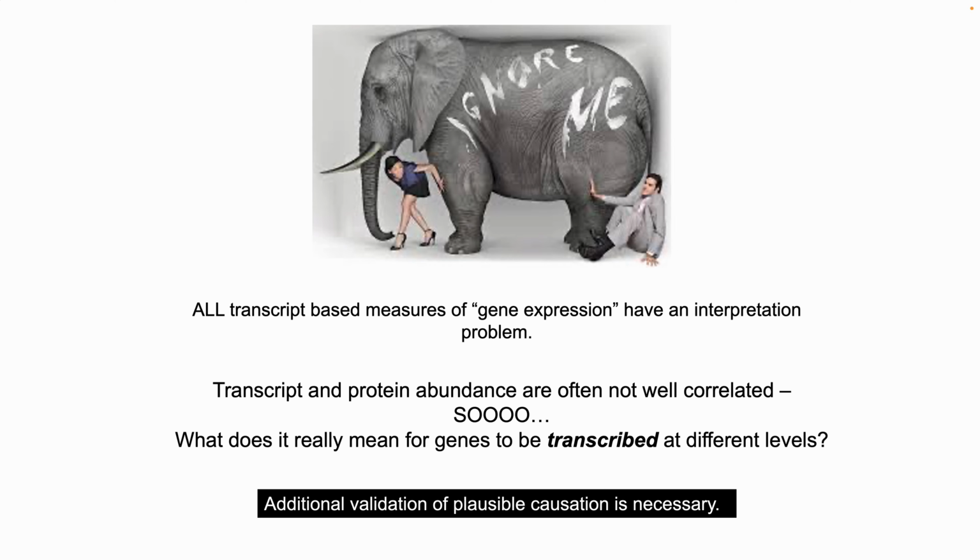And then the last slide in this is just the elephant in the room when you talk about RNA-Seq data. The biological question is what? What's our biological question for RNA-Seq?